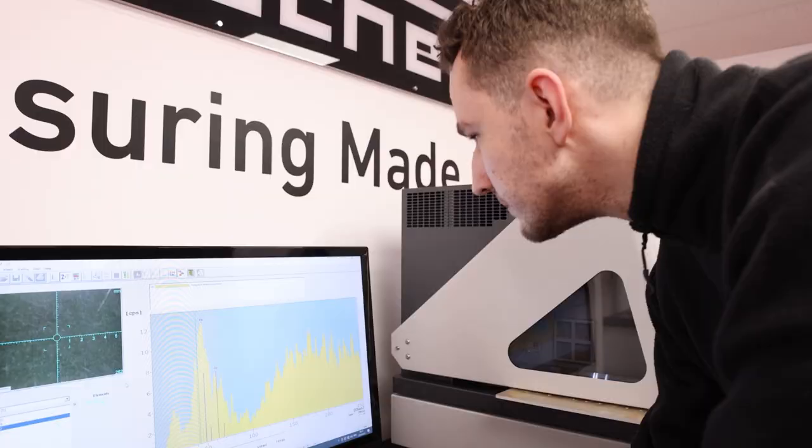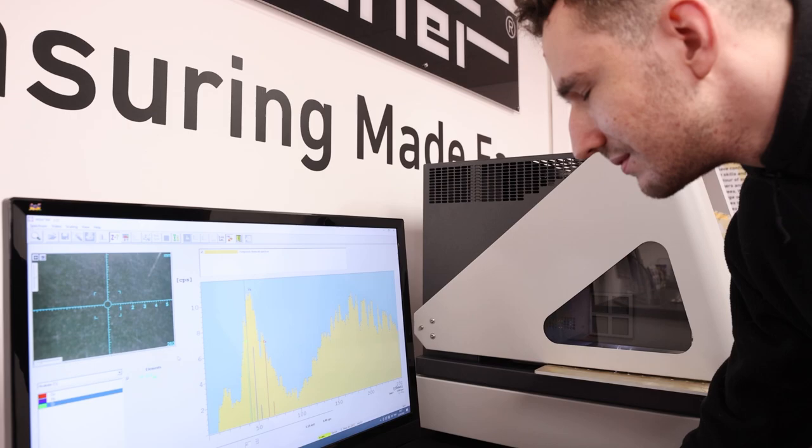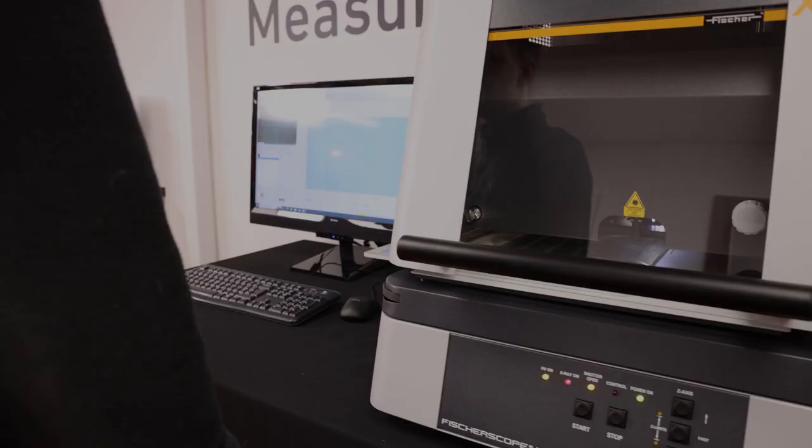In summary, the instrument is an easy-to-use, highly precise tool for measurements in general metal finishing applications.